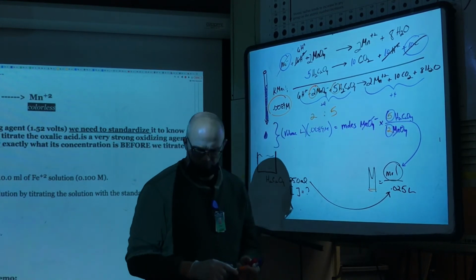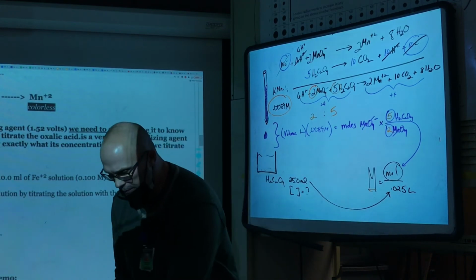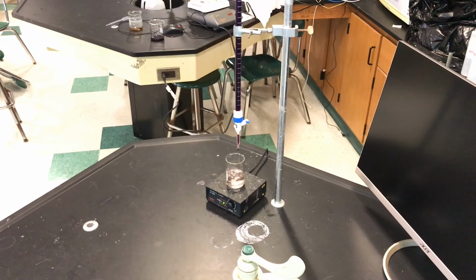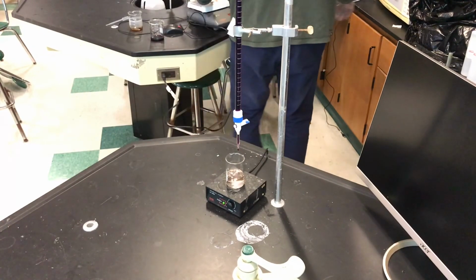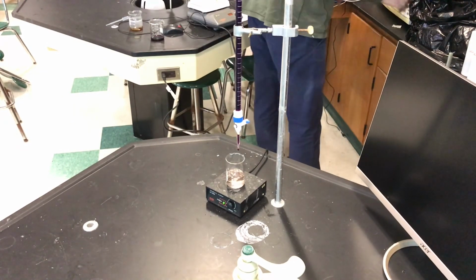Okay, let's go titrate this. All right. Now, so I'm quickly heating this solution up here, oxalic acid with a little bit of heat. In fact, I'll speed things up here with a microwave.